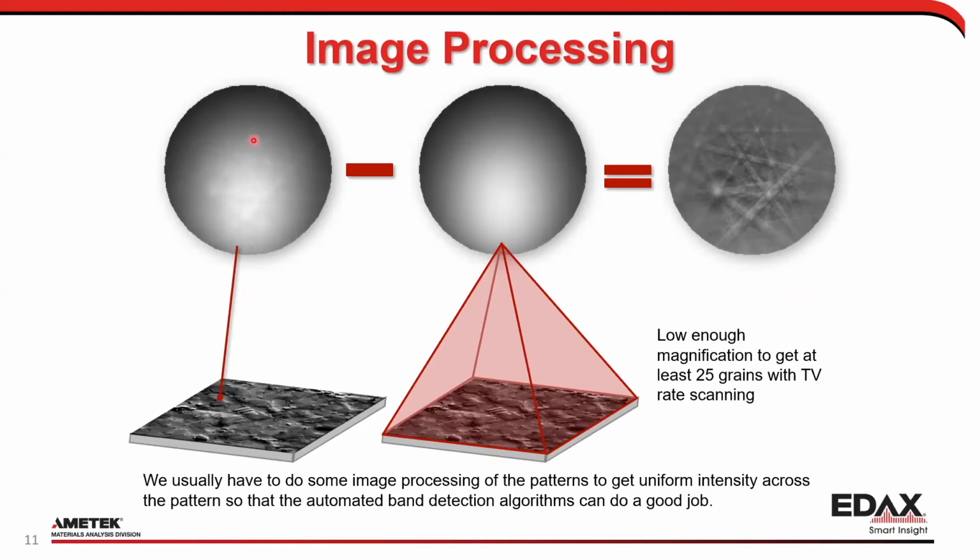Now, again, the Hough can actually find lines on this un-background-corrected image, but it's a little bit harder for it to do, so it takes more time and can get worse results. So we take a background, we subtract that background, pretty picture.